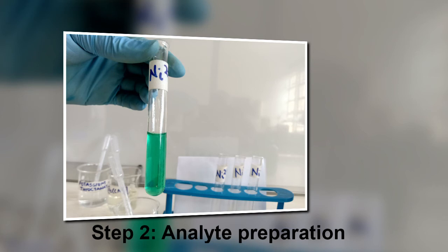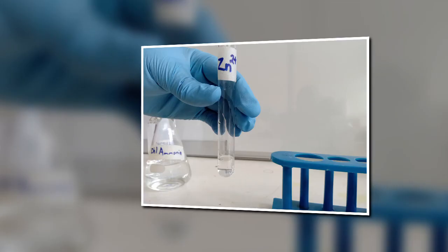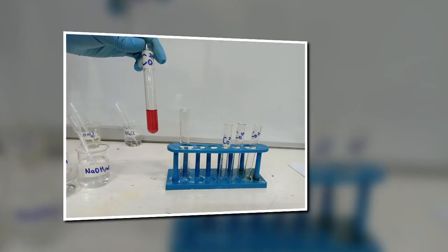Chemical reactions require a liquid medium to react. In simple words, two solids mixed together may fail to react, but once in solution, the possibility of reacting is so high. Therefore, sample preparation is key. Qualitative analysis reactions are mostly carried out in test tubes. Usually, one spatula endful of the salt is dissolved in about 5 to 10 ml of distilled water, and the solution is divided into aliquots, that is portions.